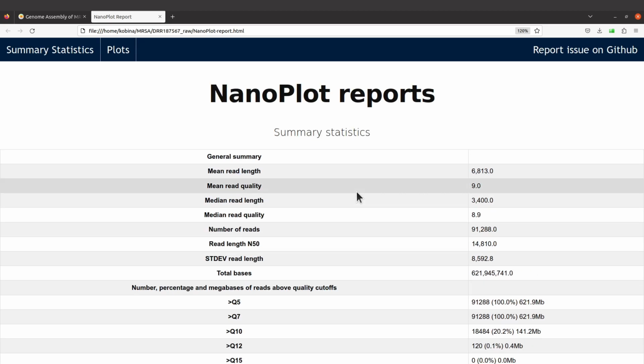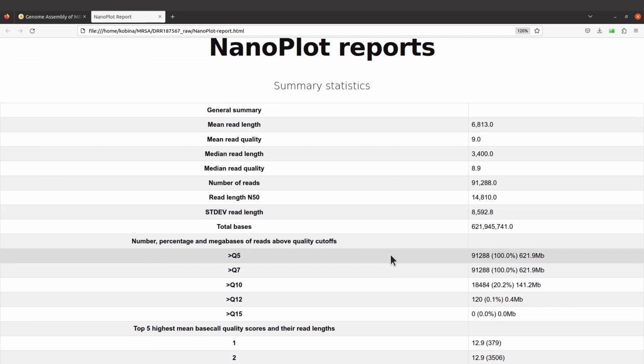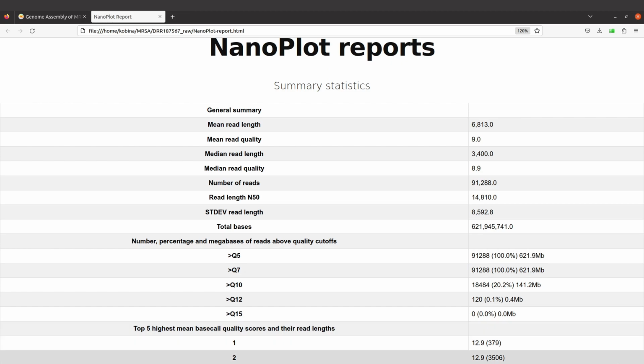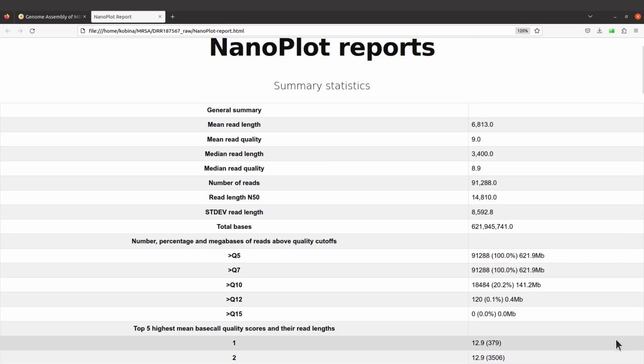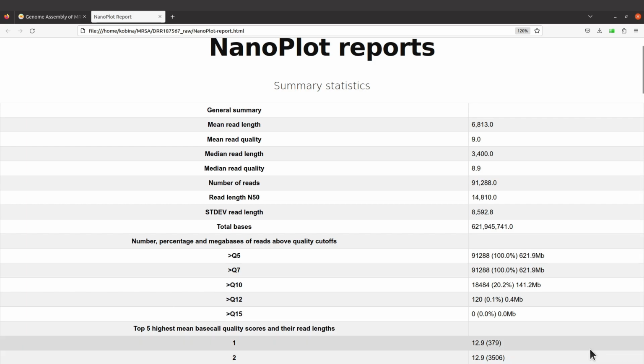So with the long reads data, if you're comparing to short reads, you realize that the long reads are of lower quality than the short reads, which is to be expected. That is what happens, by the way. And so you shouldn't be surprised if you compare this to some short read sequences. This one will have lower quality, and this is where the other step comes in. So what we are going to do next is to filter the reads, and then hopefully we should see some improvements.